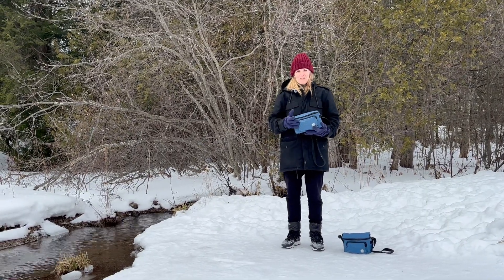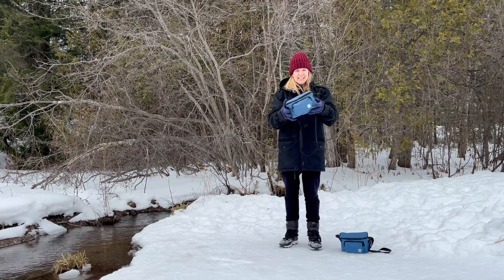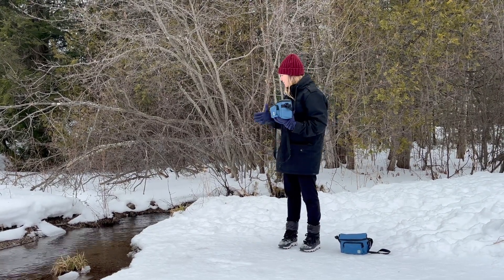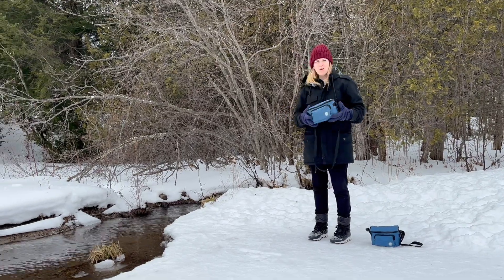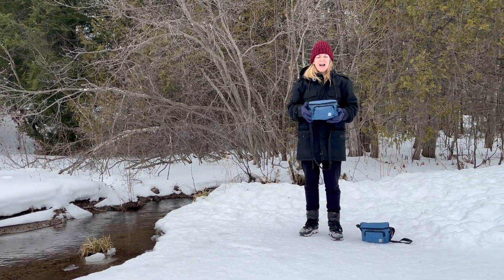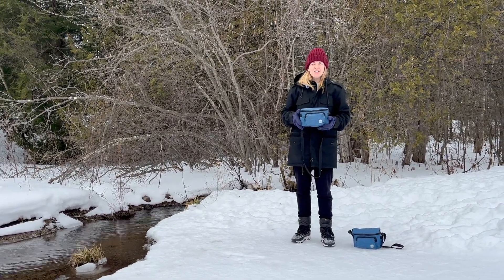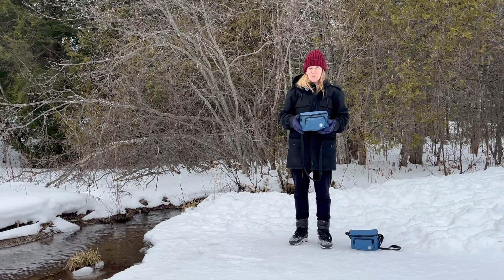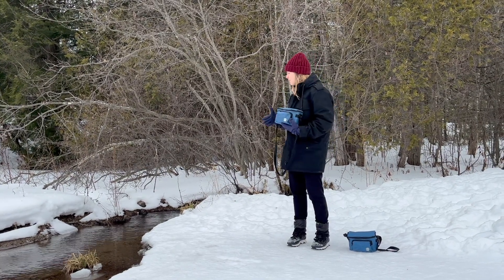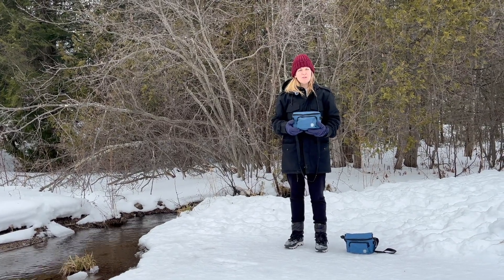I'm Kat from Water Rangers and today we're going to be looking at the winter test kit. I'm here at my sample location. Your sample location might be chosen for various reasons. A lot of people doing winter testing will test before and after a road, looking at the difference in the road salts. In this case, we're looking at the entrance to our lake and wondering if there's any influence of road salts here.